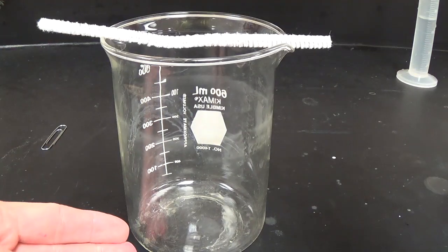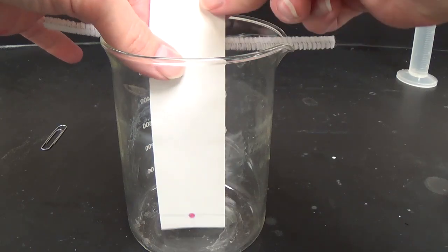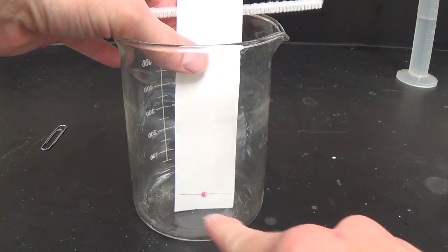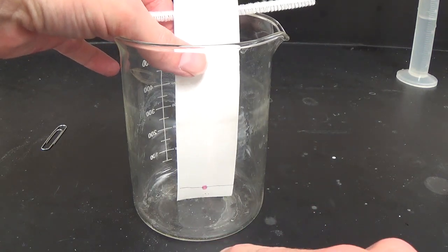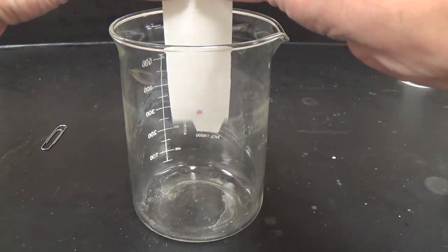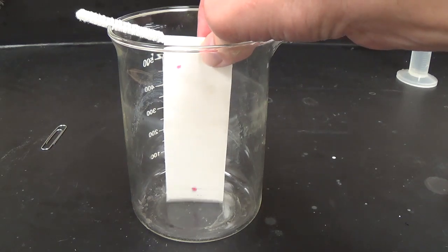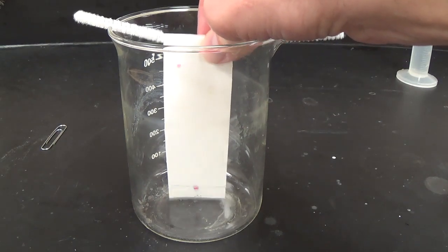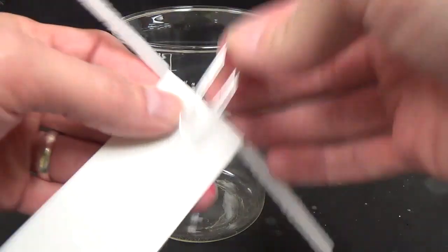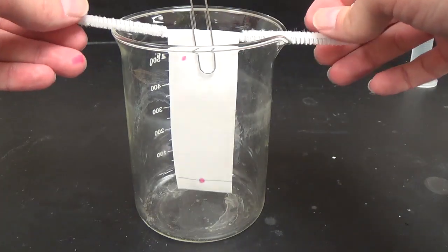Notice the beaker is empty. I'm sizing it up for the beaker, and you could do this before you dot it. Might even be better that way. But I want the bottom of the paper to just barely touch or even float slightly above the bottom of the beaker. So I'm going to wrap it around the pipe cleaner in such a way that it's going to hang barely touching or slightly above the bottom of the beaker, and then holding that in place up here with the paper clip.